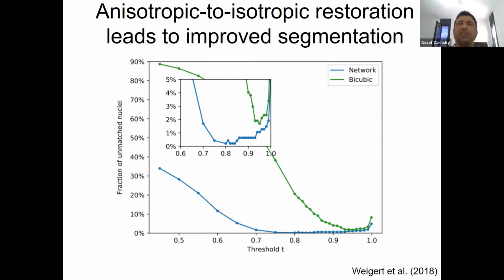Okay, so we had two demonstrations by now. We had matched images, high quality and low quality. We had high quality and artificially produced low quality in the Z. And now we're going to see the magic of just using simulated data. So now we're going to look at training data that is not even coming from an experiment, train a model and then test it on experimental data, okay?